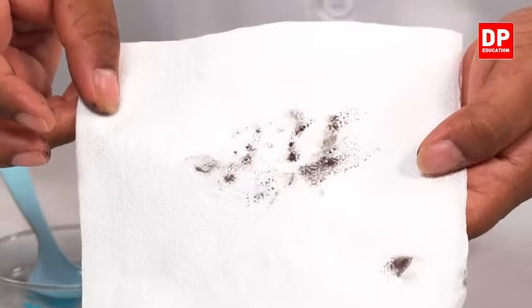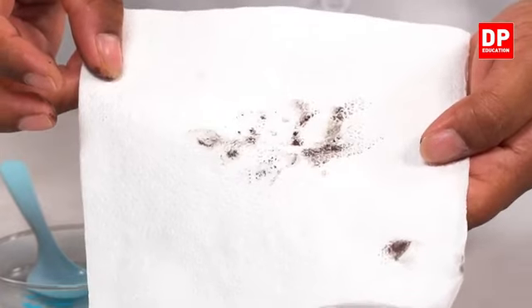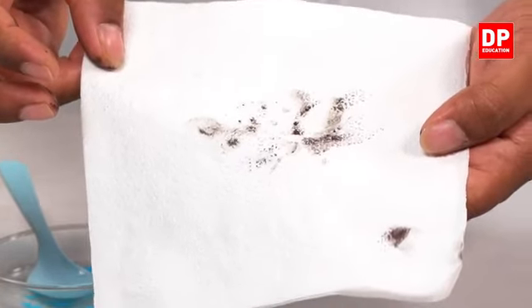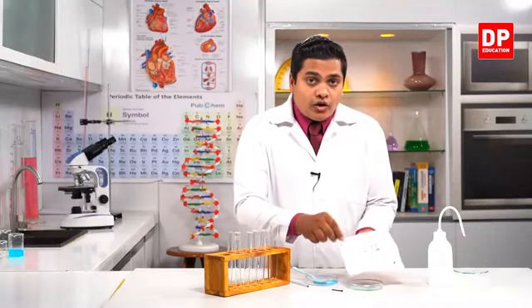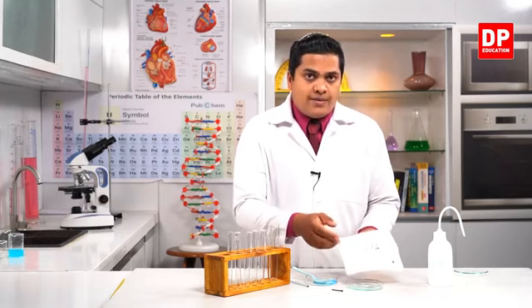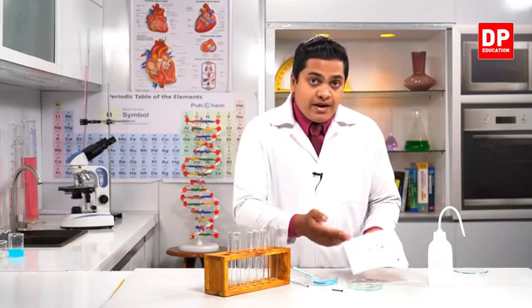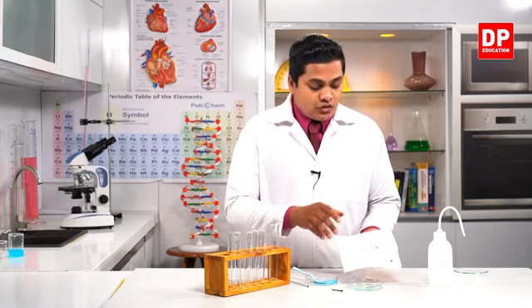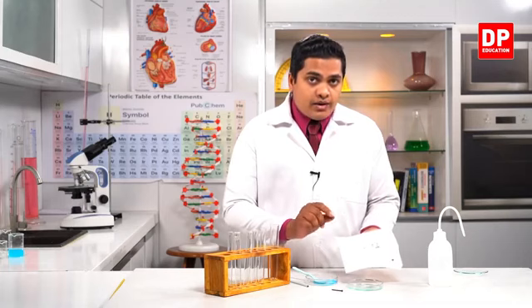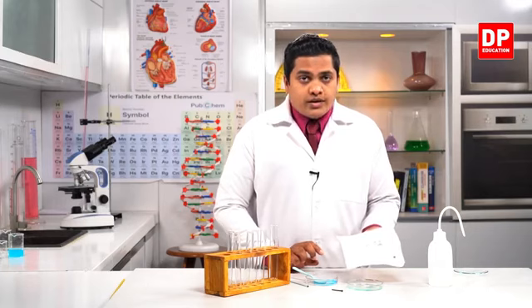In the copper sulfate solution, when I add the iron nail, the copper is going to deposit, or the copper is going to precipitate. These copper substances are not getting mixed with the solution, I mean the liquid. So these substances remain within the solution after the chemical change or chemical reaction. Substances which remain within a solution after a chemical reaction are called a precipitation. This is called a precipitation.